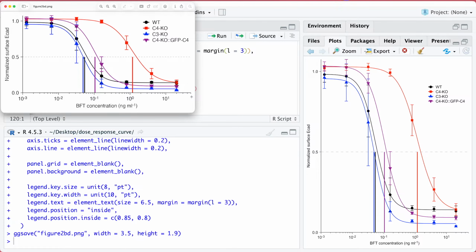Now we have our IC50 values drawn up to the 0.5 line. And I think this shows the IC50 values, but I can see this adding confusion. I think I'm a little bit confused as well, because it's odd that these lines don't intersect 0.5 where the curve does.